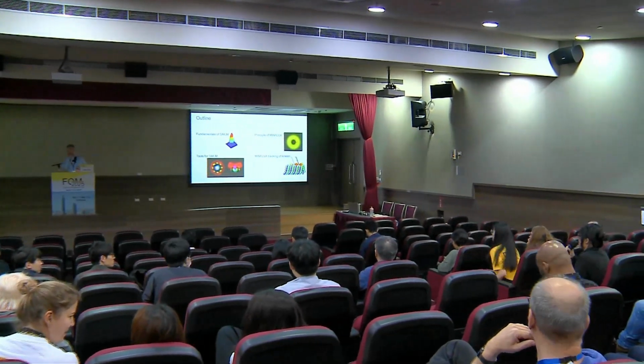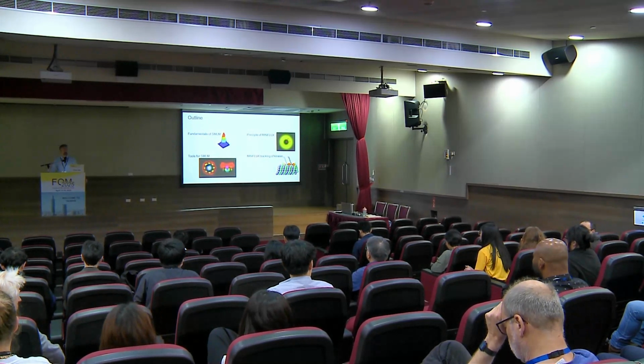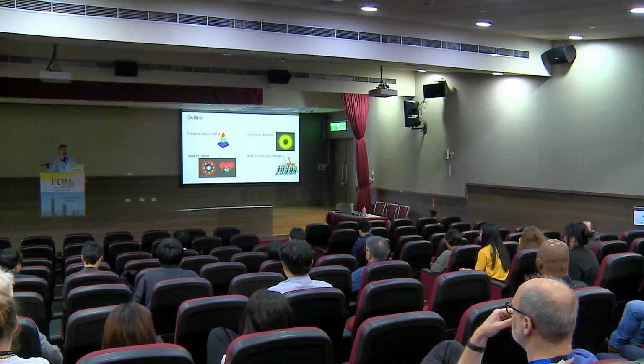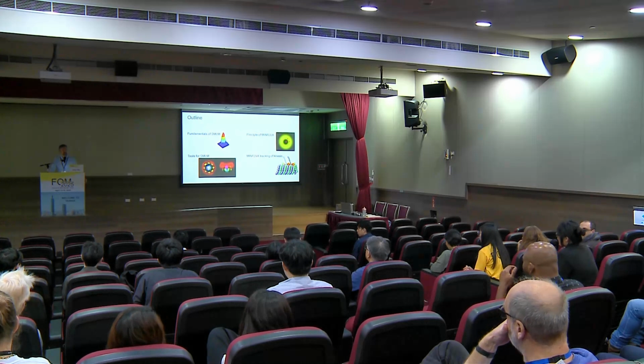Oh, okay, thank you. I have some questions related to the user side. Previously I tried different software for the post-analysis. Imaris is a commercial software, and they also try a lot of different machine learning approaches. For detail, I don't know, but it looks quite amazing.